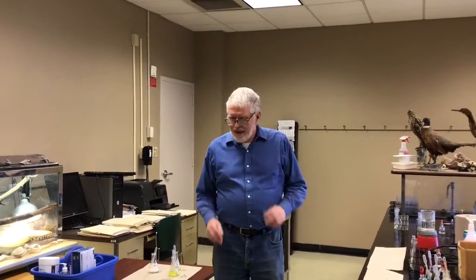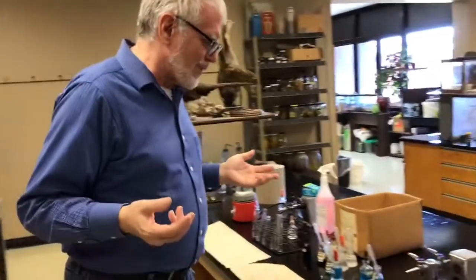Go. So now we're going to run our actual experimental tests. We're going to see what sort of materials are in a variety of foods. You've got a table, the very last table in the lab, that has the list of foods. And you'll notice that it has a big box on every column for results. So that's what happens when you run the test. And then you have a column that says yes or no. Is there sugar? Is there starch? Is there protein? Is there lipids? That's what you're going to be recording.